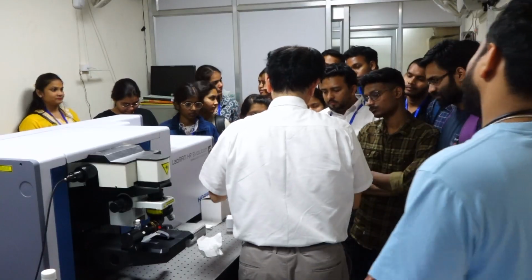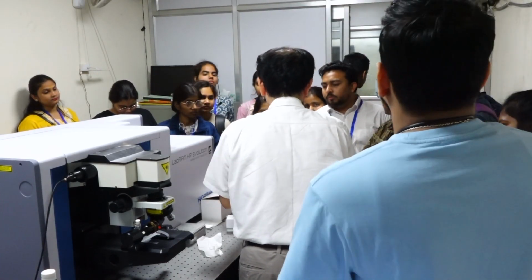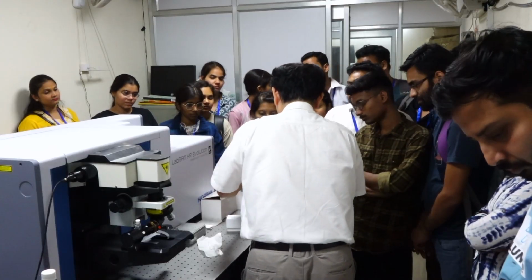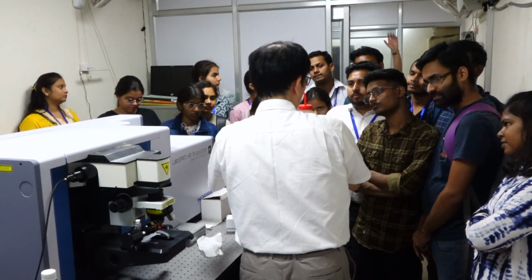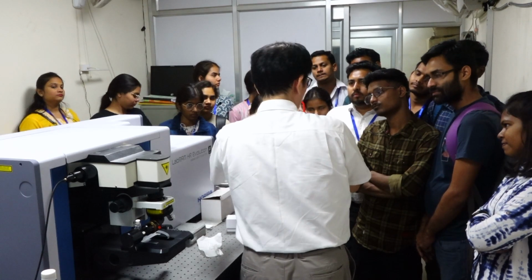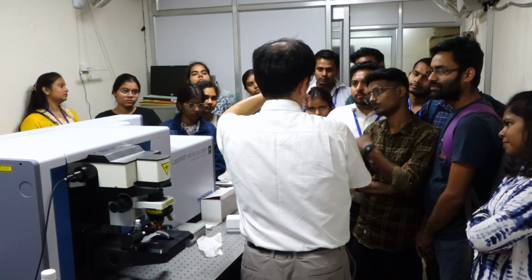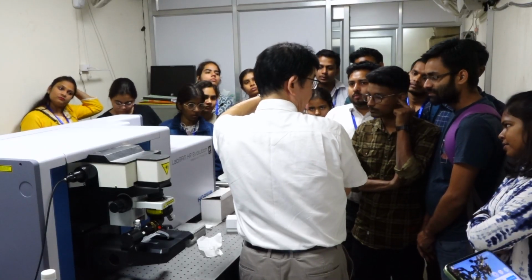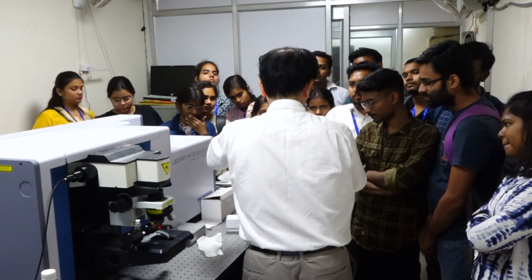So, in principle, Raman scattering occurs in all directions. If we detect from the side, this is a 90-degree configuration. If we collect the signal from the top, this is the backscattering configuration. So there is no difference.